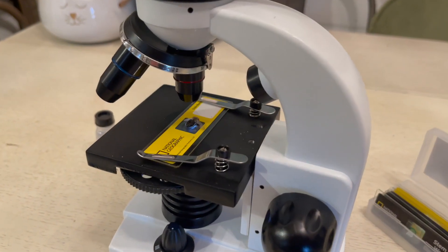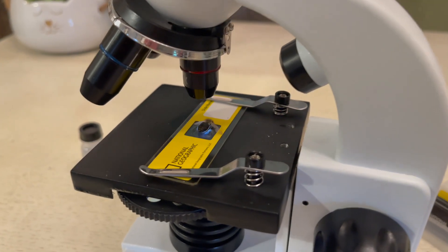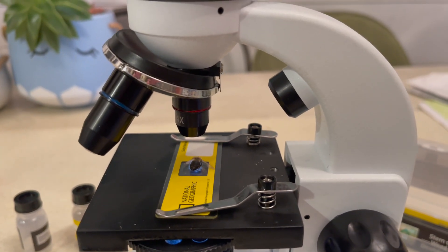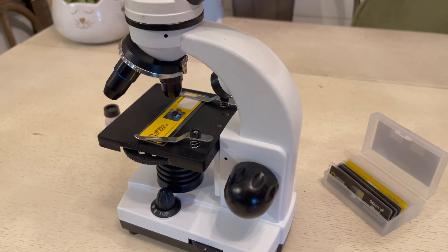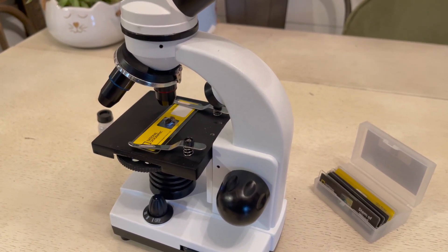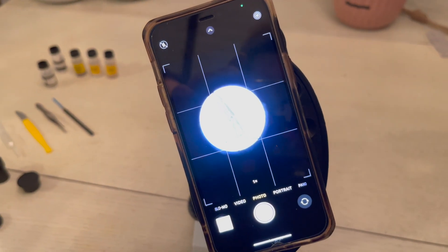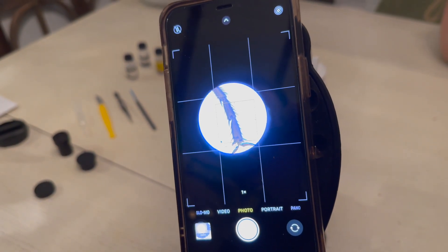Once we worked through the slides we started pulling stuff out of the yard to look at, and one of the more interesting things was a dead honeybee. I have a few honeybee hives and there was a bunch of bees in one hive that died due to the cold this winter, so we placed it underneath the microscope. There is a tool included to help with that, but we just took a look at it as it was and it was really interesting.